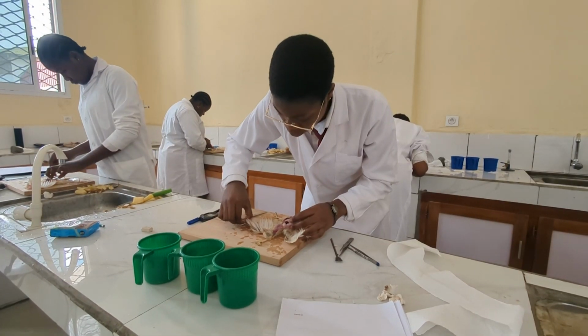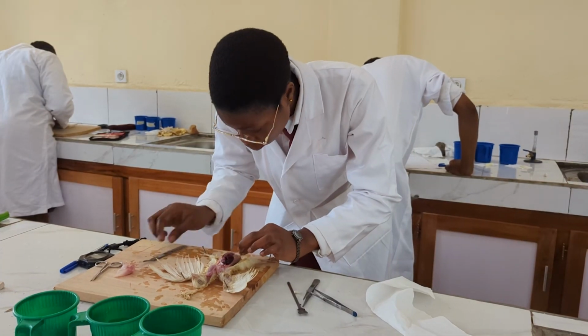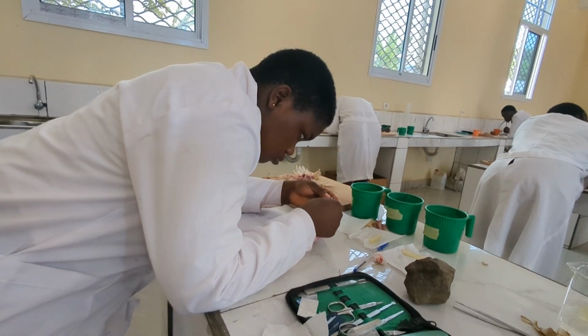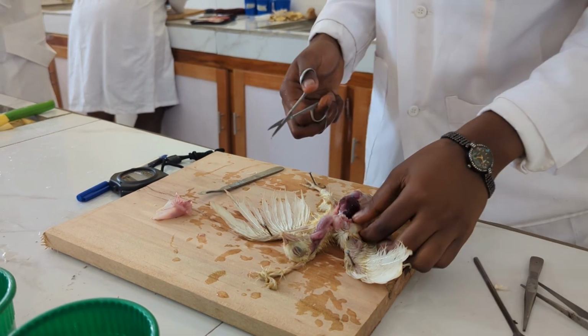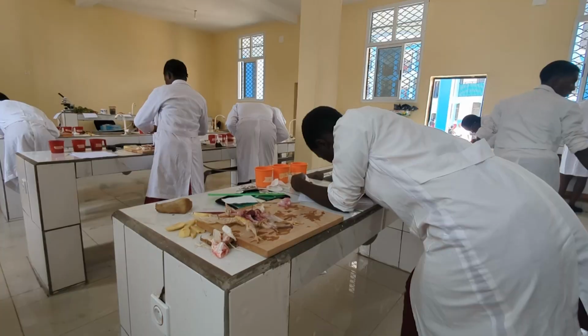This science student, who is a GCE candidate for 2025, explains the process involved in the dissection of a chick. We began by incising a little portion of the fowl. Before that, we even wet it, then incise, then cut a little part of it right towards the trachea.